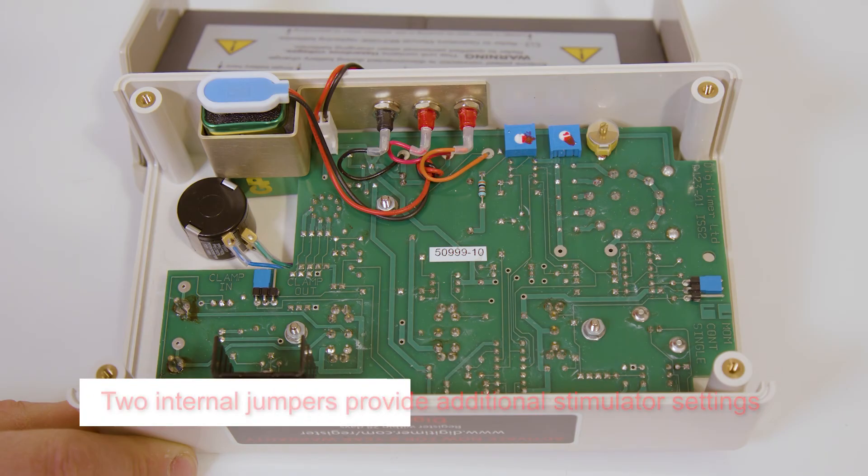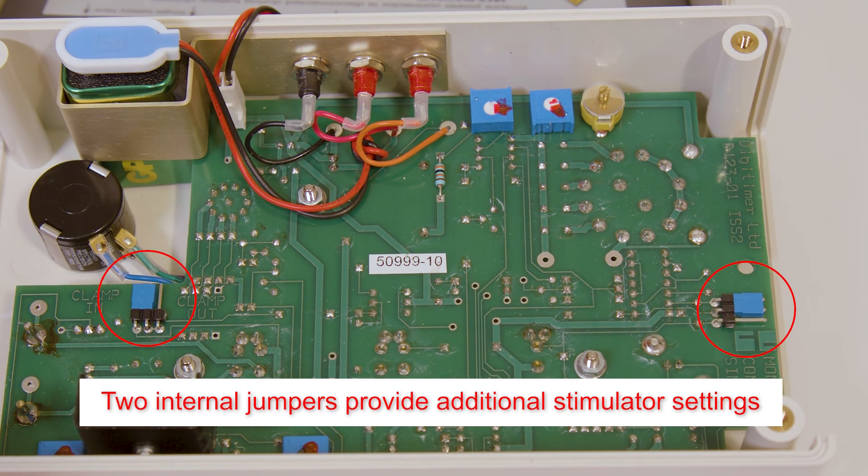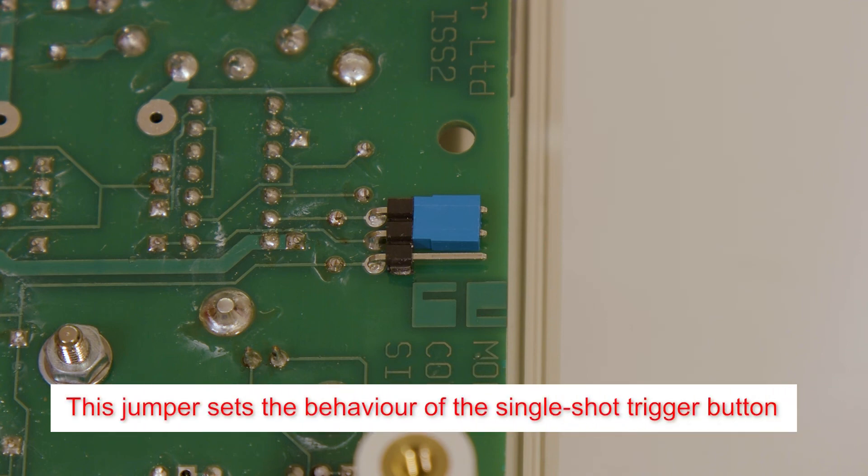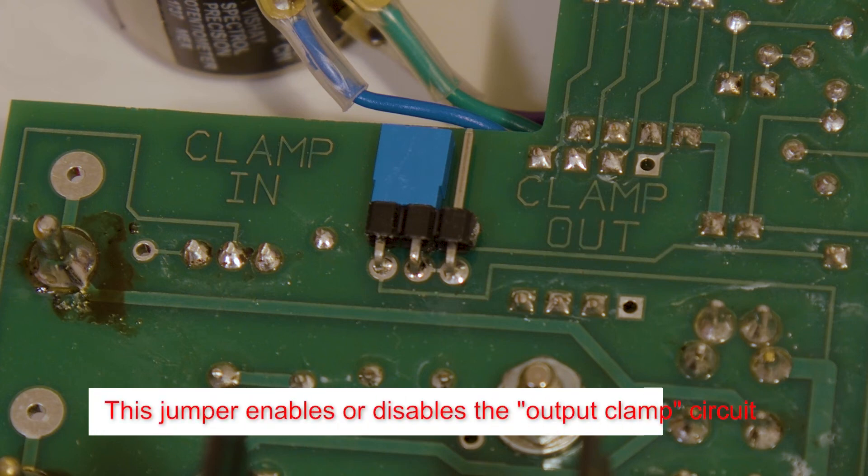The DS3 has two internal jumpers that allow the operator to change the behaviour of the stimulator. On the right hand side of the PCB is a blue jumper relating to the single shot button. When in the MOM, or momentary position, as shown, single presses of the trigger button give rise to stimuli with the duration determined by the front panel settings. In the CONT or continuous position, the duration of the press determines the duration of the stimulus. The second jumper controls the output clamp circuit, which when set to clamp in, discharges the stimulating electrode for 20 microseconds after each pulse. This prevents a build-up of capacitance at the preparation during repetitive stimulation.